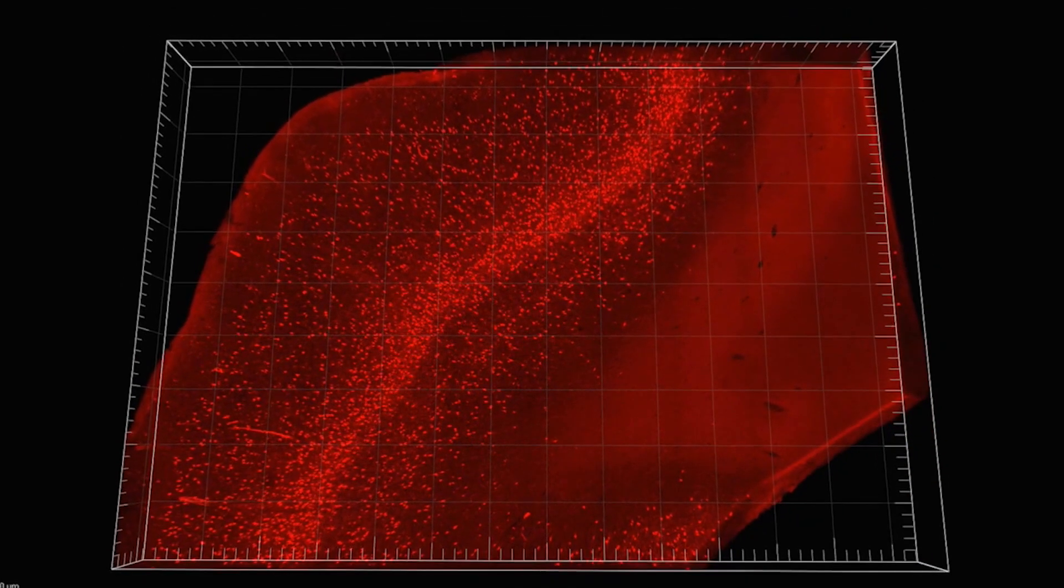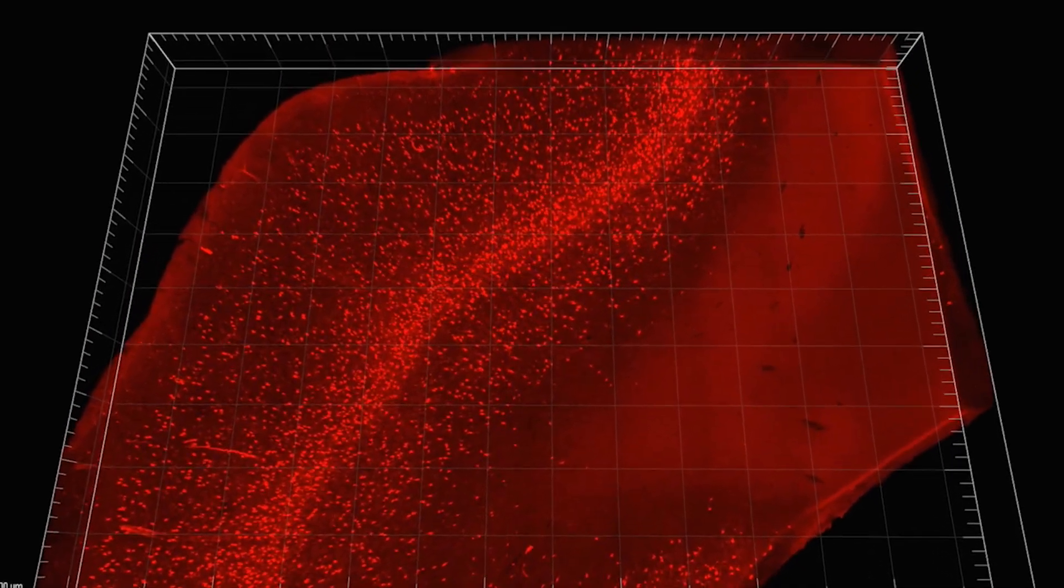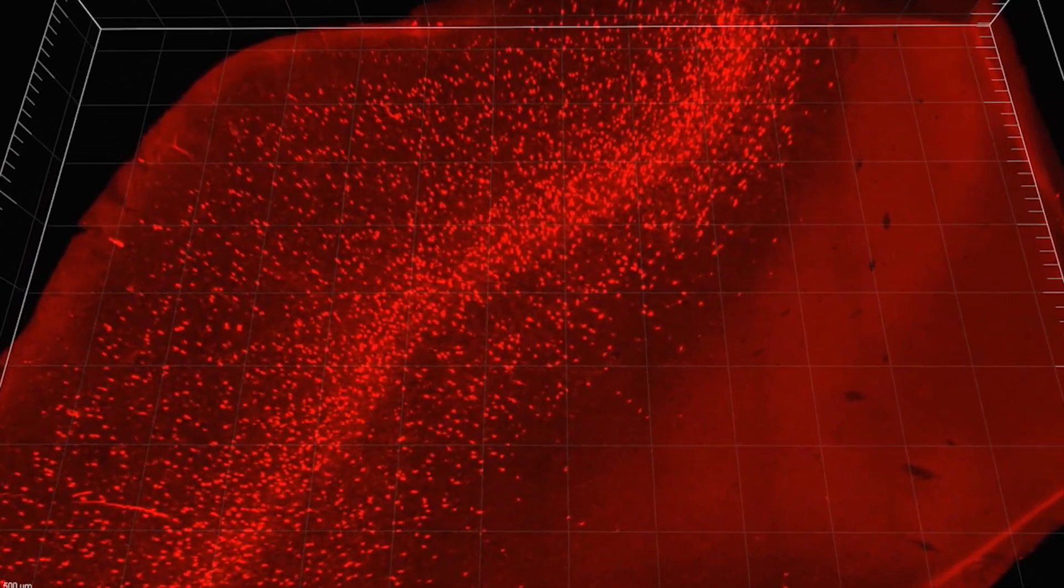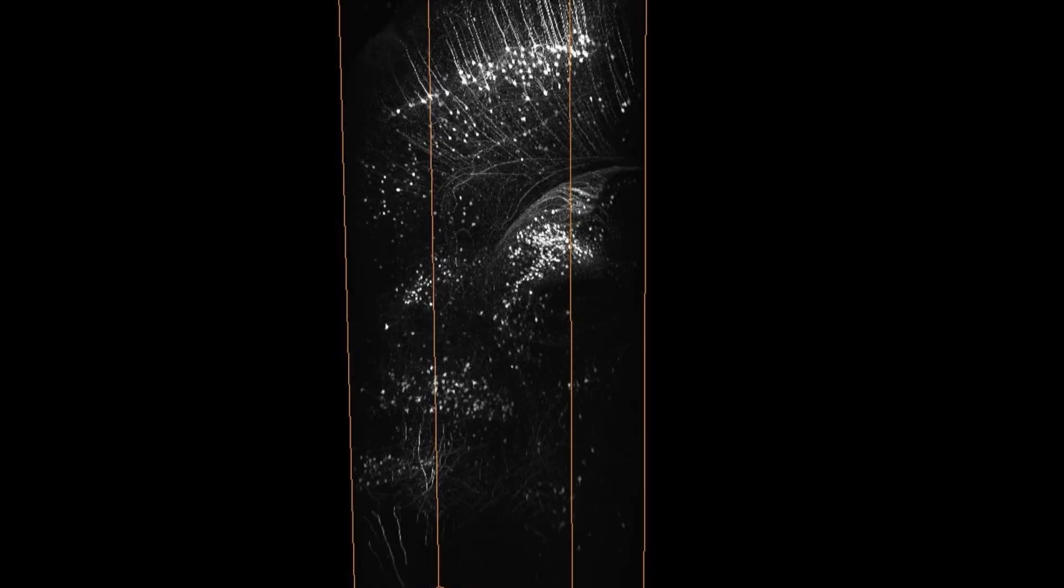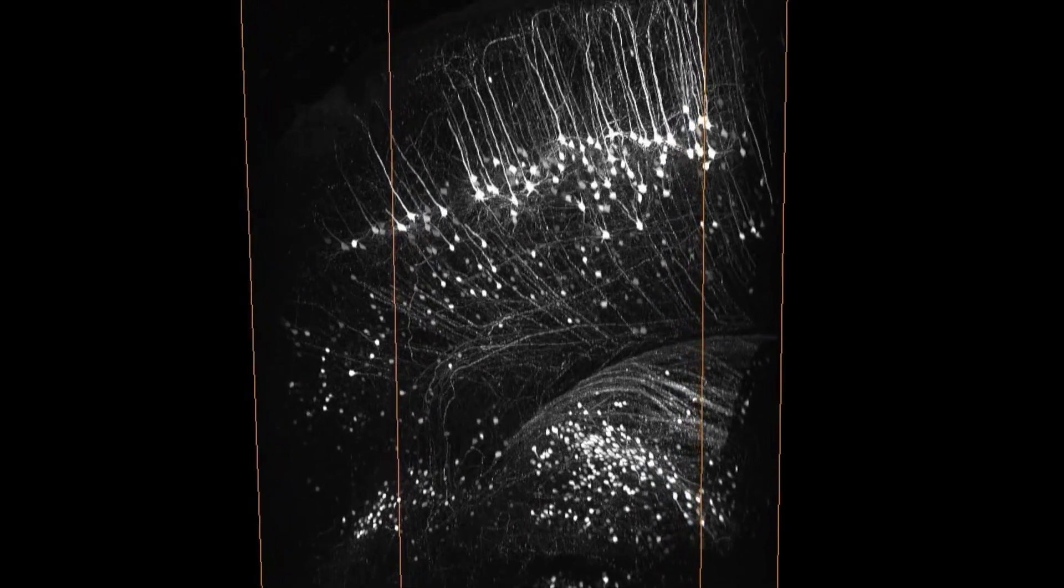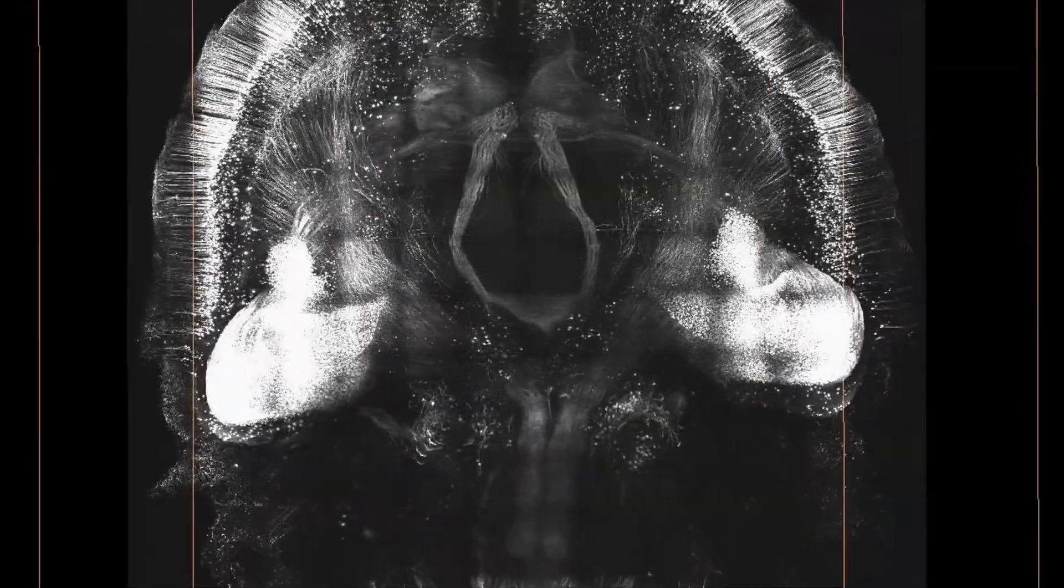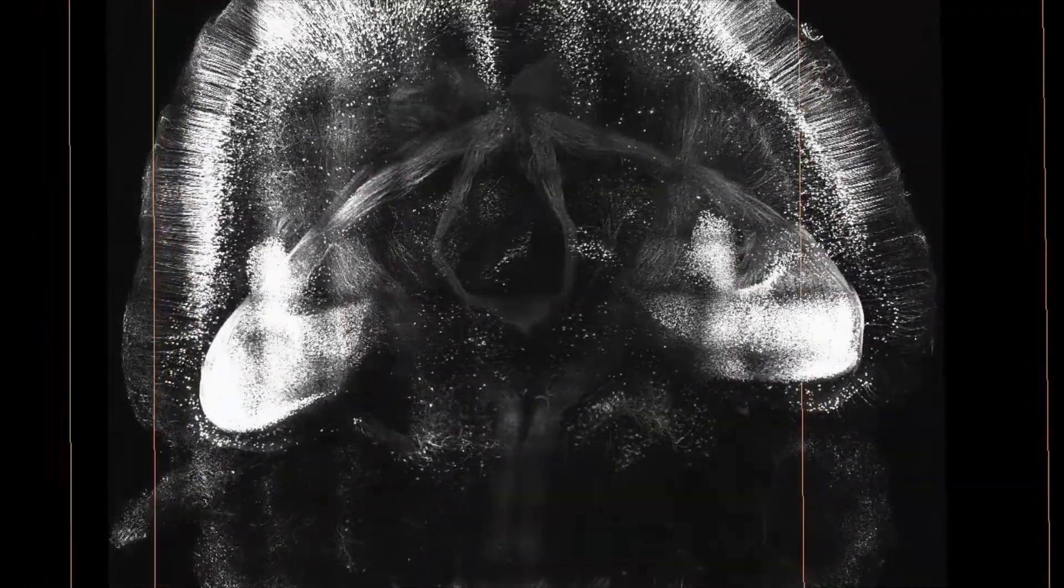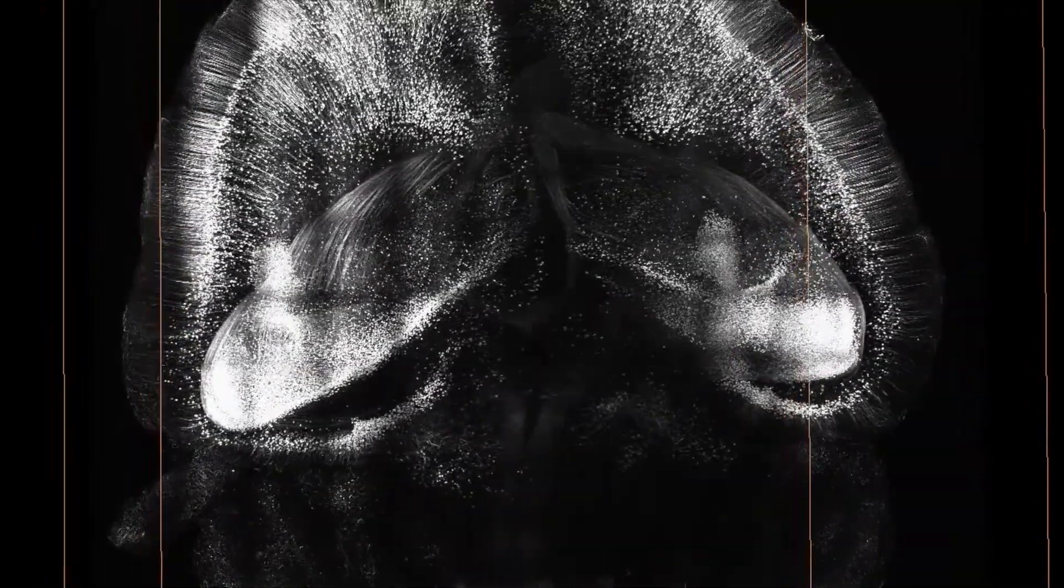This is actually a human brain. So this is Clarity that's done on human brain tissue. Dyseroth says researchers will be able to use these 3D maps to compare and contrast brains that function normally with those that don't and take steps to fix the problem.